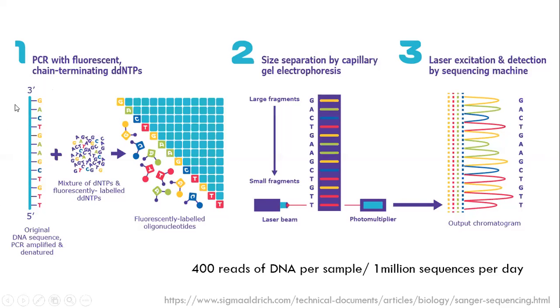might be given as a crude DNA sample, right? You cannot visually see the nucleotides. You are isolating from the cell. You got a DNA sample, you measure the quality of the DNA, but you absolutely don't know what the sequences are from one stretch of the DNA to the other. So unknown sequences in a given template DNA can be seen in the chromatogram.